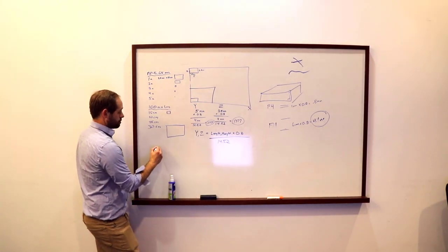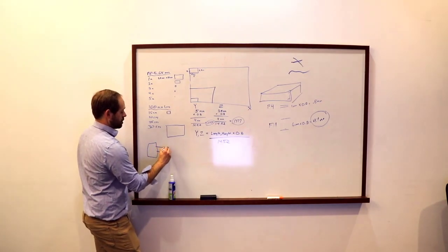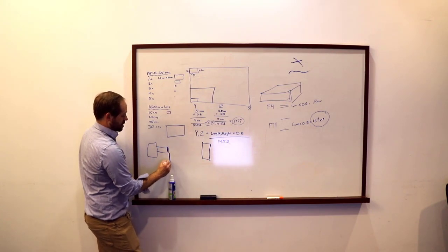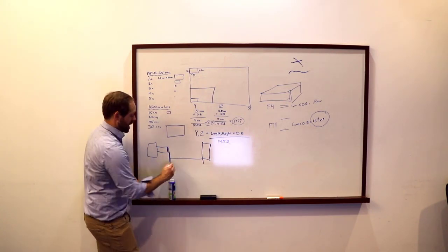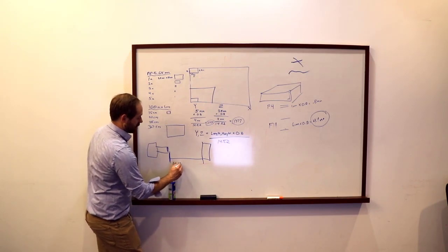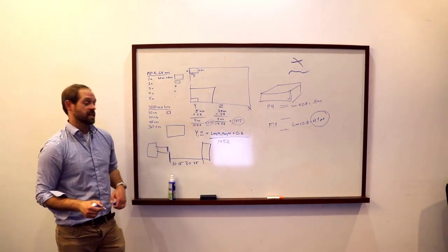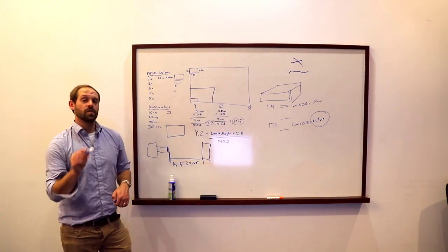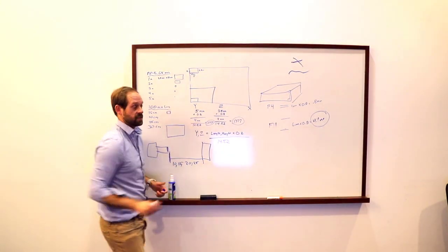So it's very important that you measure the distance. If this is your camera and this is your lens, and you're looking out towards the box, you want to measure the distance from the front of that lens down to where you're imaging. And you want to do that in 10, 15, 20, 25, and so on. So 5 centimeter intervals, and as long as you pick one of these 5 centimeter intervals, then you can always refer to that table that you've been provided to find your x, y, and z values.